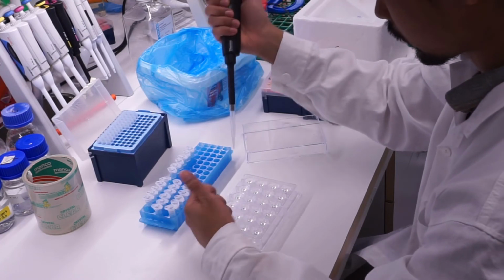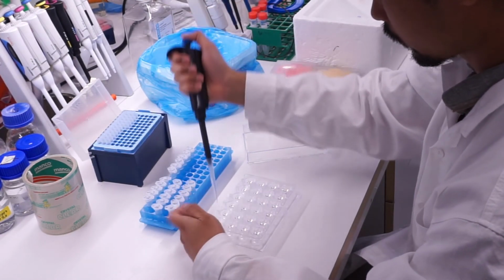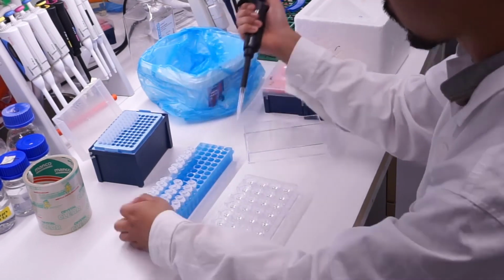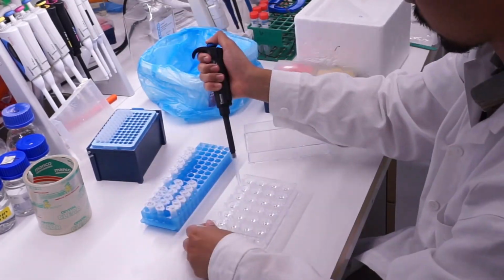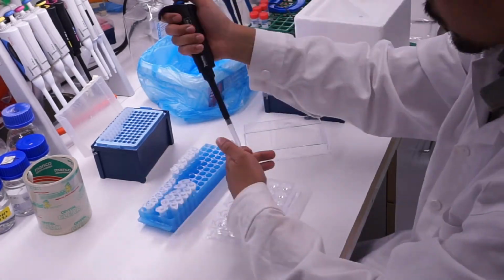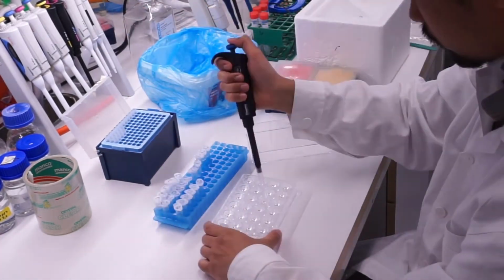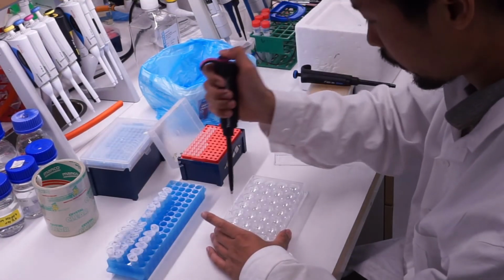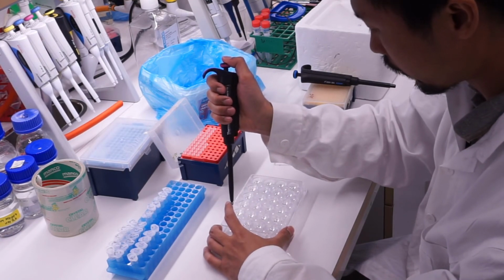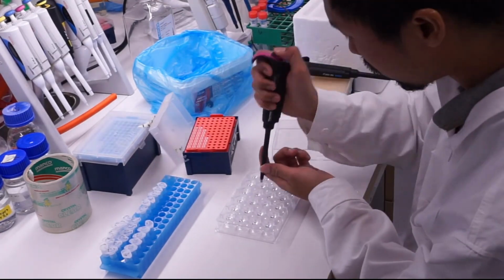First, 500 microliters of crystallization solution was placed in the reservoir. Put 1 microliter aliquots of crystallization solution on the drop wells. Repeat for all wells so that reservoirs are complete.